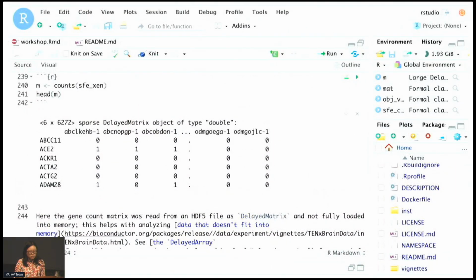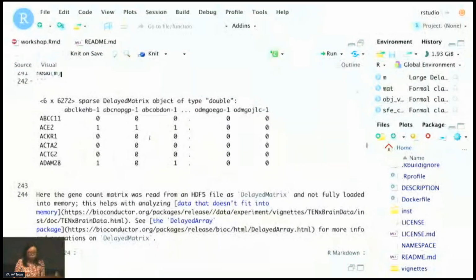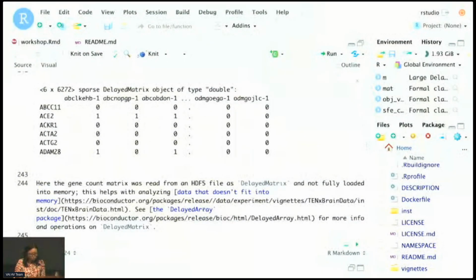Remember there was the H5 file for this, so this is read as a DelayedMatrix. You can go to the documentation for the DelayedArray package to read up more about it. Basically, DelayedMatrix does not load the entire thing into memory for H5, and it really helps with analyzing larger data sets. Aaron Lun has used DelayedArray to analyze a single cell data set with over 1 million cells on his laptop.